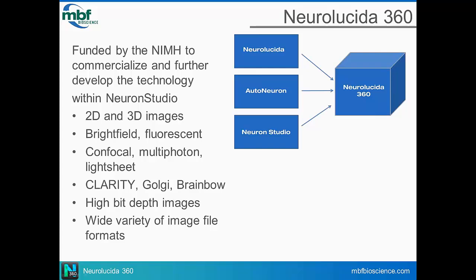And so Neurolucida 360 is actually a research grant that we received from NIMH together with you folks at Mount Sinai, Patrick Hof, and you.